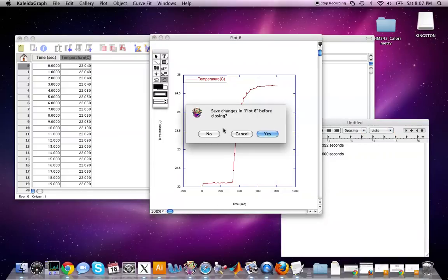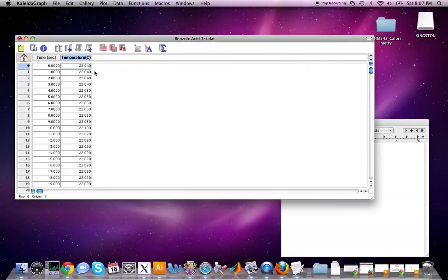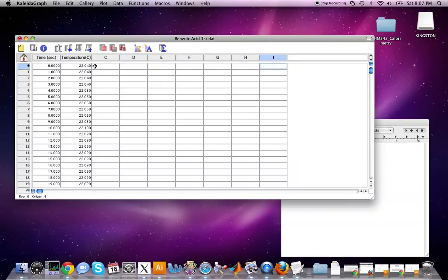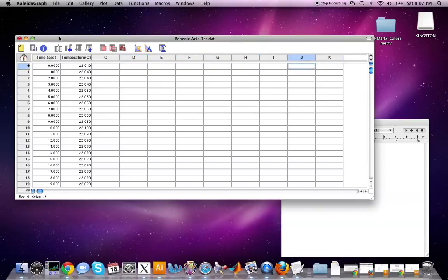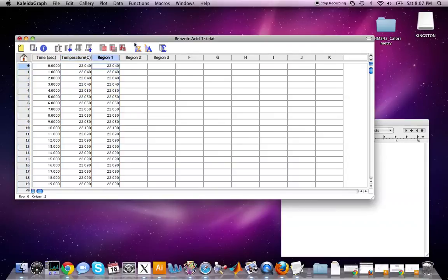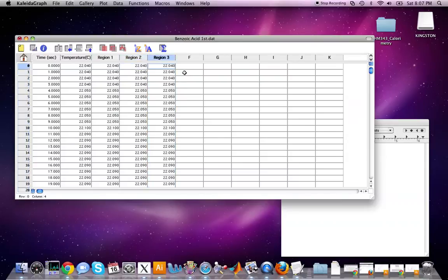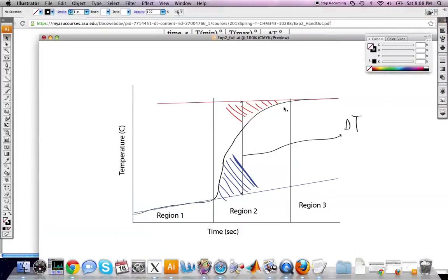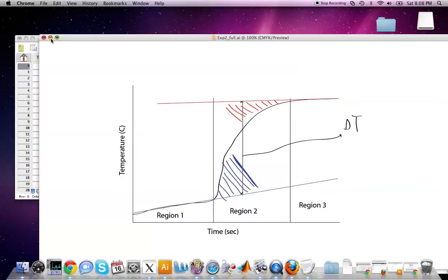Close the plot. With the two region boundaries identified, make three extra columns in the spreadsheet: Region 1, Region 2, and Region 3. Copy the temperature data into each of these columns. The reason is that we want to separate and plot each region independently so we can fit lines to regions 1 and 3 individually.